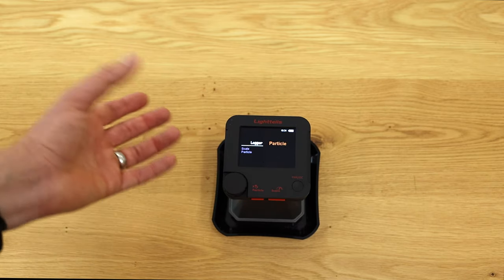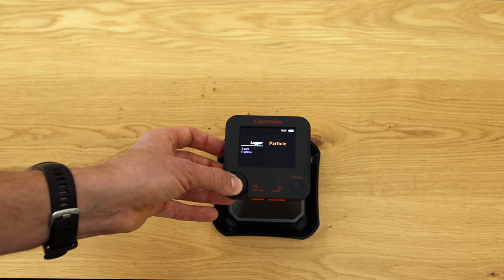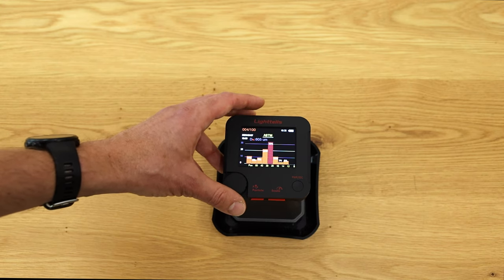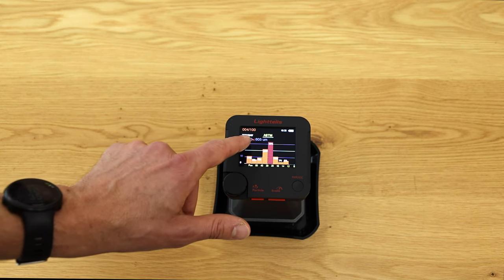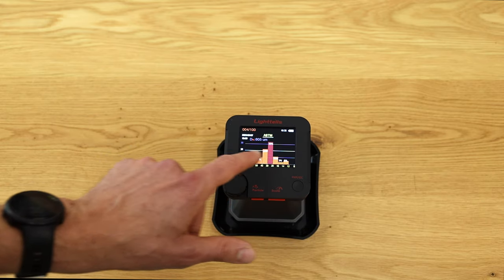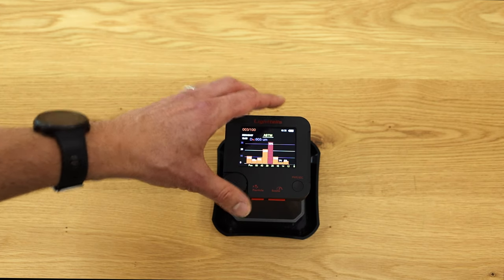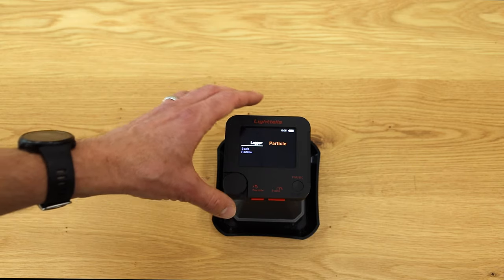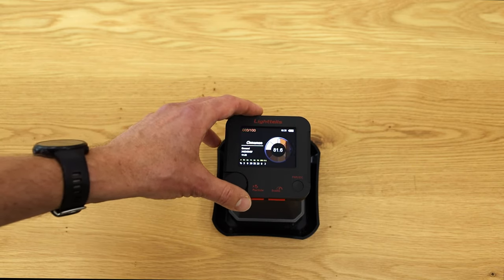First let me show you the Logger. I have logs of particle sizes where I can see previous measurements — for example, one from September 7th at 10:30 — showing the distribution of the particles. I'll show this in more detail when we go into the particle measurement function, but this is where all past measurements are stored.